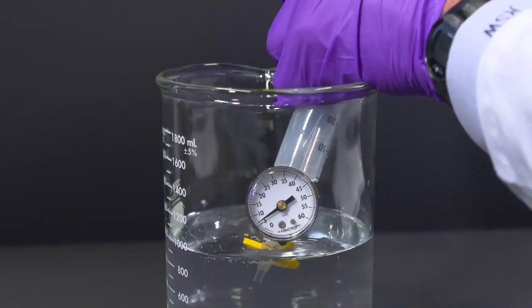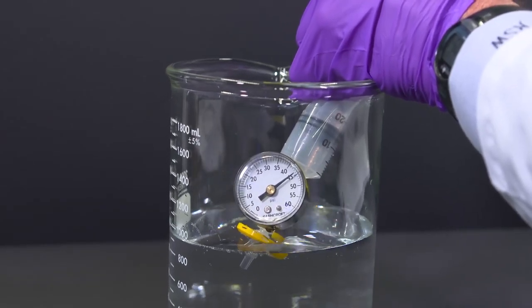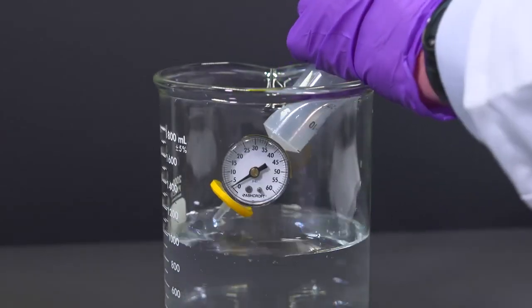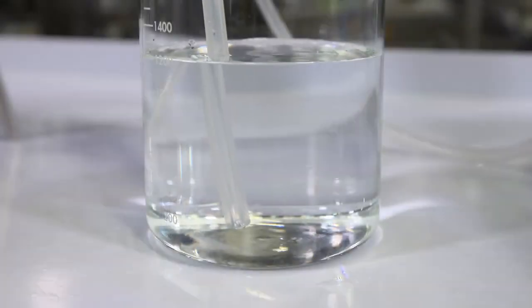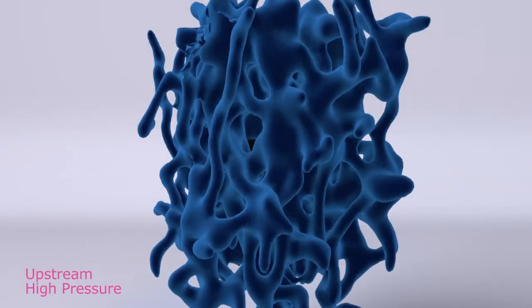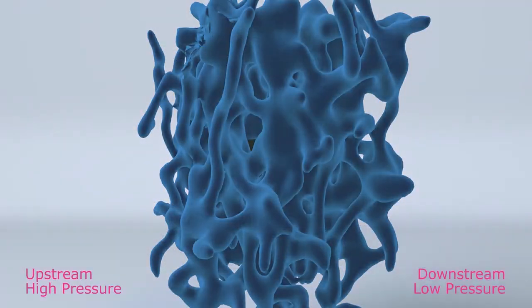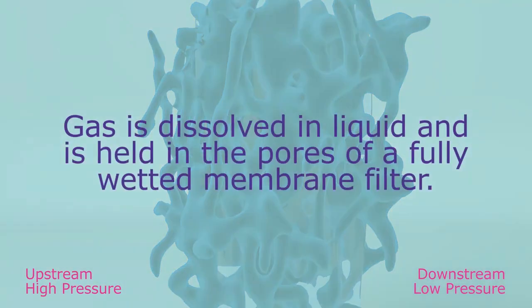In practice, with process scale membrane devices, there are other physical phenomena we have to deal with. When I demonstrated the bubble point with a syringe filter, we didn't see any gas flow at pressures below the bubble point. But at pressure below the bubble point, there actually is a very small flow of gas due to diffusion, which is primarily due to gas solubility in liquid. During an integrity test, at pressure below the bubble point, upstream gas pressure results in gas dissolving in the liquid in the pores. This gas diffuses across the filter to the downstream side.